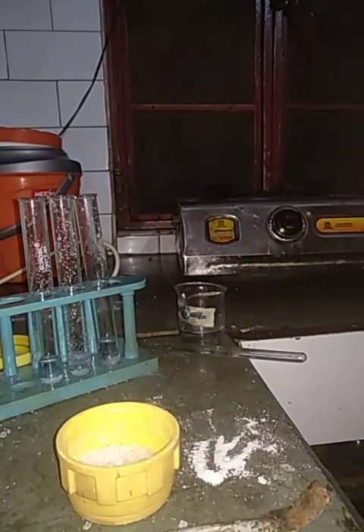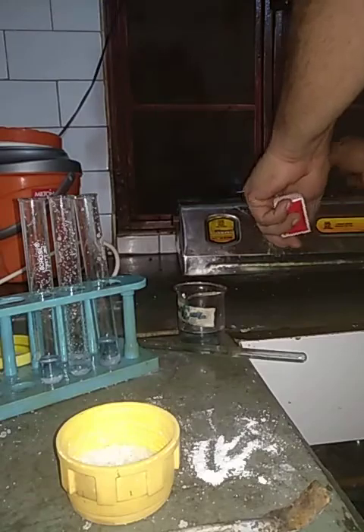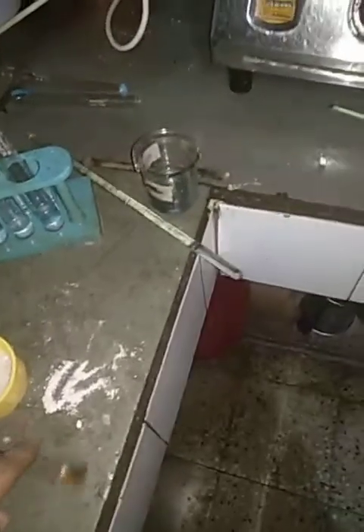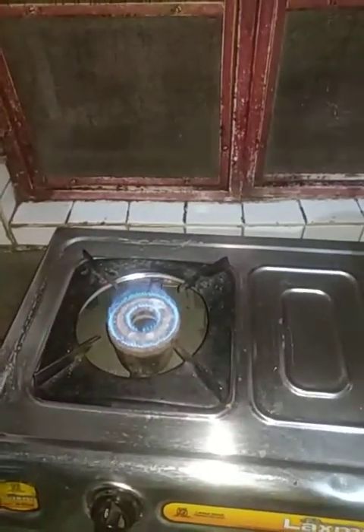Let me switch on the flame so that we can check it out. Now we have the flame. So now first we shall take some of the powder from the barium chloride. See, I have some powder on my finger. That is what I am going to check on the flame by throwing it.